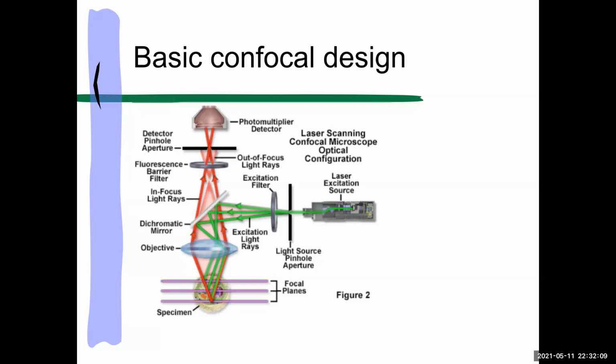People started coming up with this idea, but it was really in the 80s that we had commercial systems that were actually viable. The kind I was describing was considered a fantastic confocal. We were excited to work on it, fighting for time. It's still the story. Pretty much if there's a confocal, usually people are fighting for time on it because it's just beautiful and it's very satisfying to use.